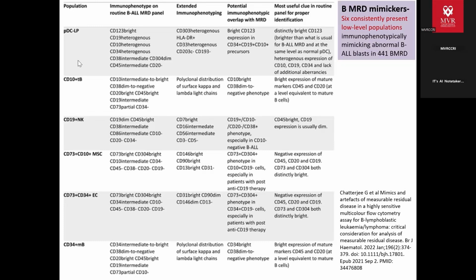Has it reached the sensitivity of 0.01%? Whether the sample is hemodiluted. There are so many parameters. Just seeing a positive or negative MRD does not fully tell you what the report is. And LOD and LOQ in a very good report will be mentioned at the bottom of the patient's report.